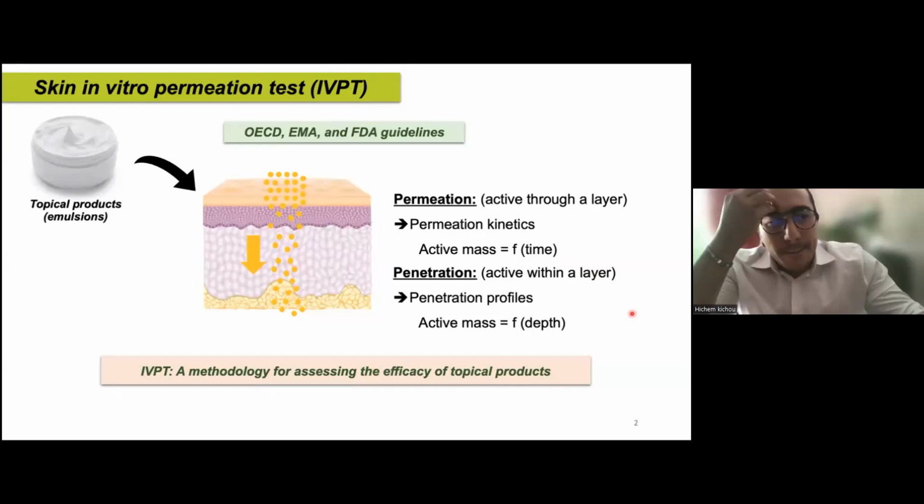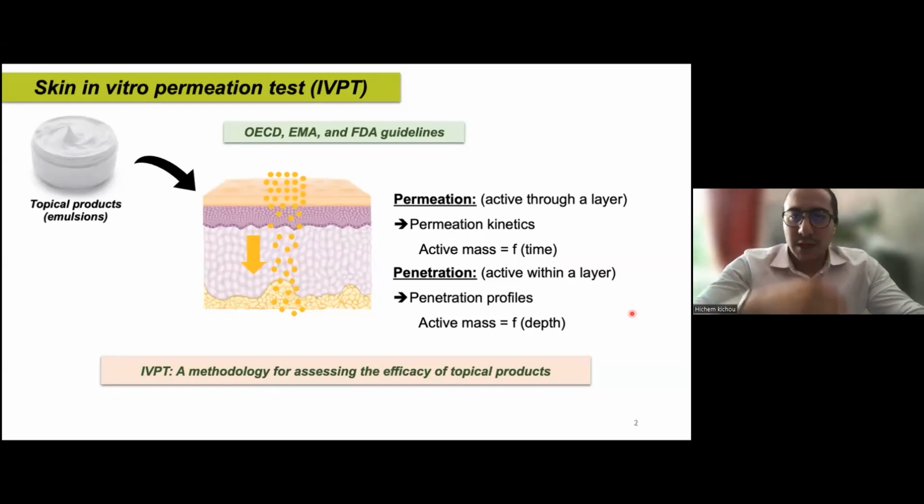So, evaluating a topical product involves conducting an in vitro permeation test, IVPT, on skin, according to regulatory guidelines, European but also international, like FDA guidelines.